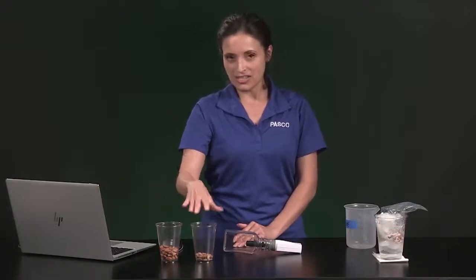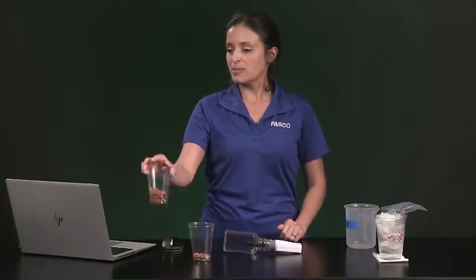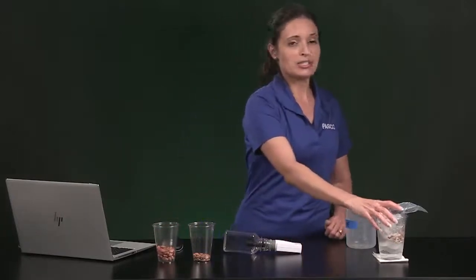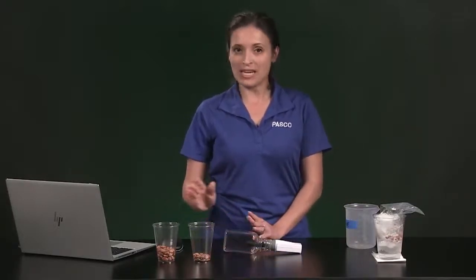So each sample, I took the mass of each sample. So this dry sample has a mass of 20.30 grams. The soaked sample has 43.01 grams, and the chilled sample is 42.51 grams. So if you're normalizing the respiration rate, once you get to the analysis, you will need these masses.